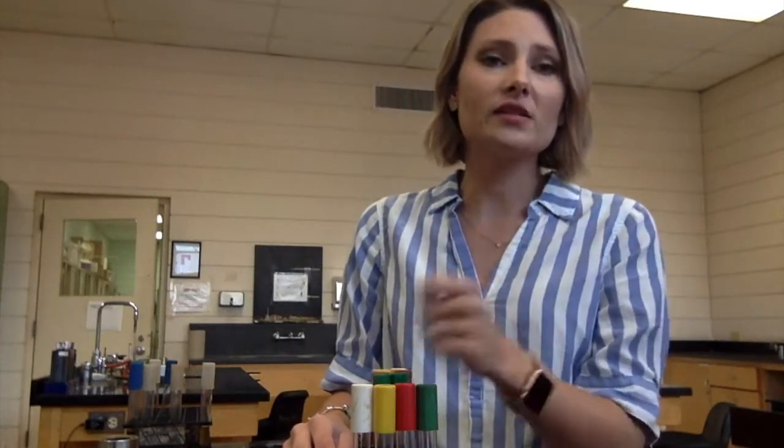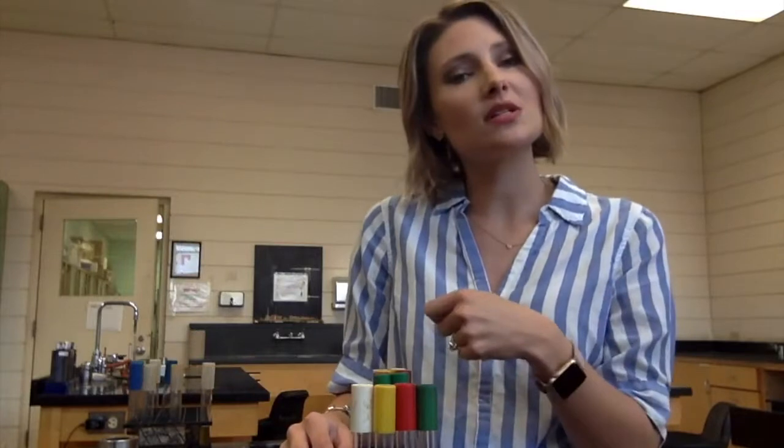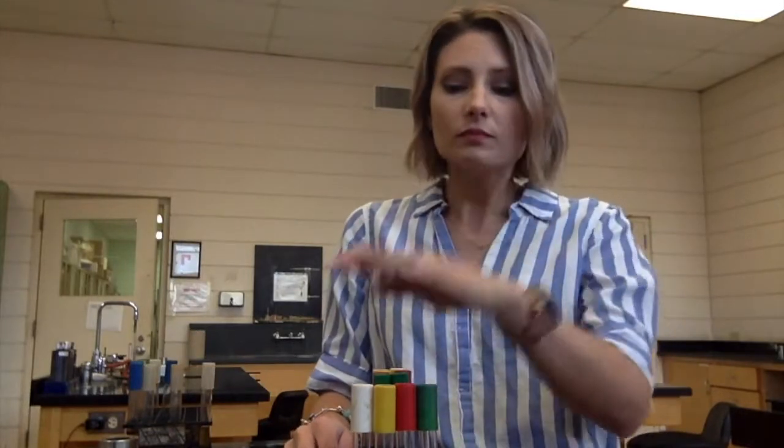And then there are other bacteria that are fermenters, but only have the ability to ferment certain kinds of sugars, depending on which enzymes they produce. So just because it's a fermenter doesn't mean it's going to be able to ferment all kinds of sugars. Now, the reason why we do this set of tests is to help us identify an unknown. So based on how many sugars it ferments or which sugars it ferments, it is going to give us more information about our bacteria to be able to try and identify an unknown.